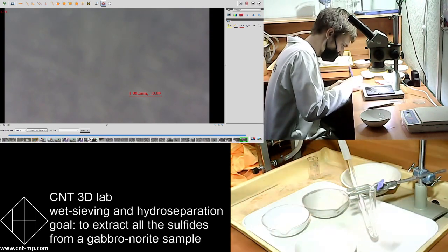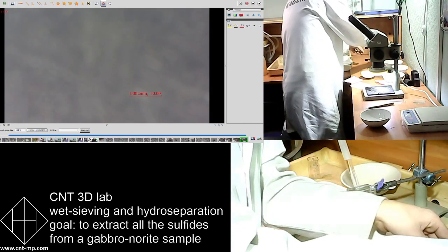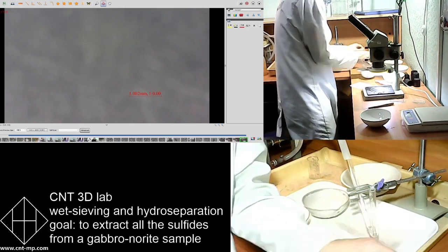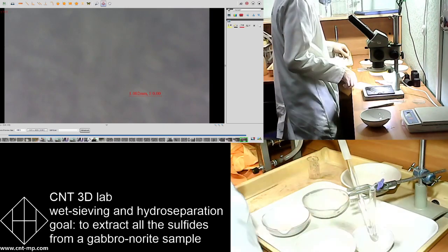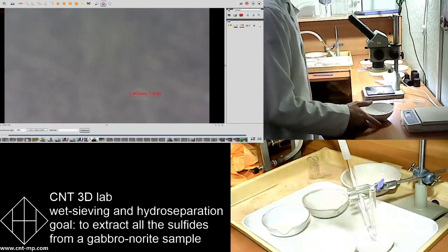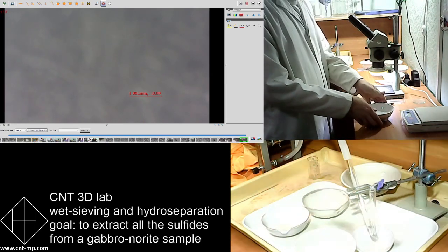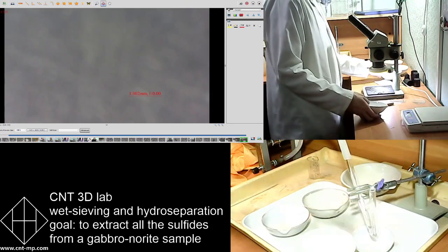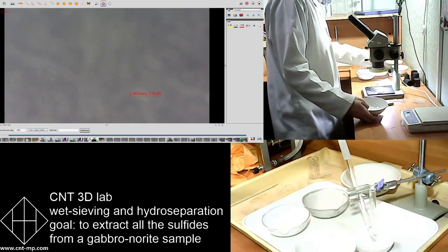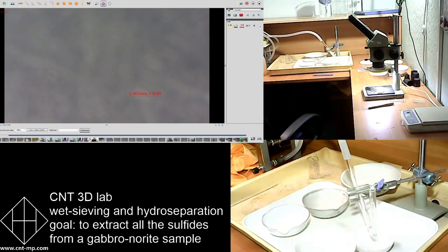Eva is asking, what determines when we change the larger glass pipe to smaller in HS? Okay. The tube is long simply because it hosts more material. Because you need more space to separate particles from each other by density, you need more space. So the longer tube is used for bigger amount of sample, because whenever you start with the fraction as a raw, you have maximum amount of material. You have to cut the size of that amount.